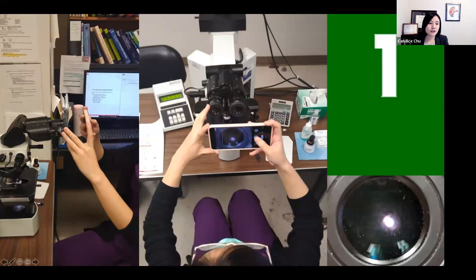And I teach them step by step. So first, use your hand to stabilize your phone and your microscope and start from the far, far away location where you only see a spot of light.